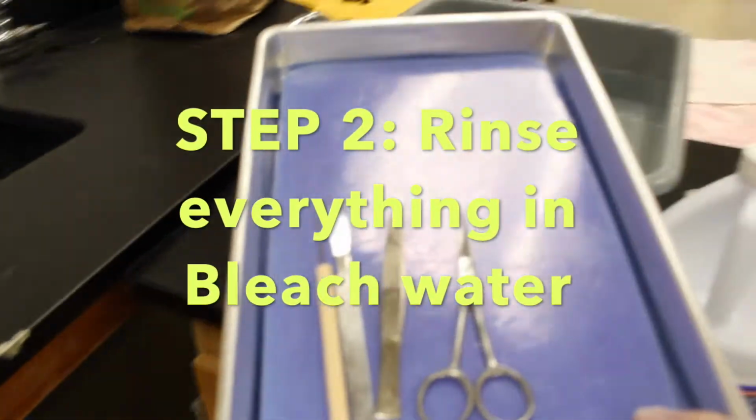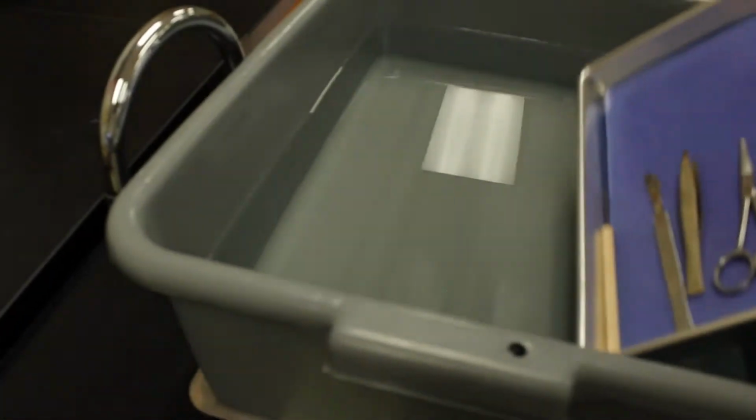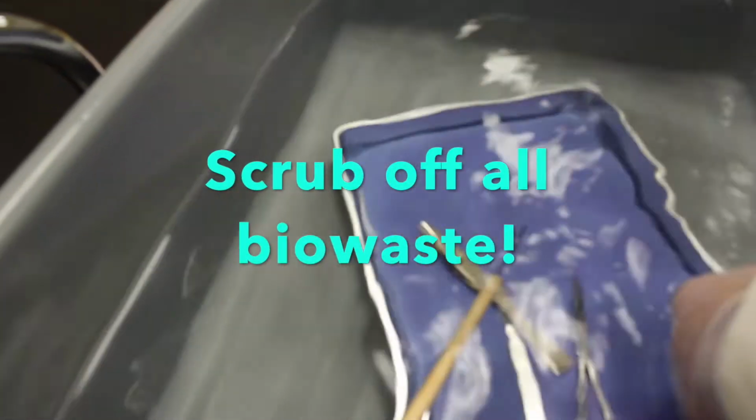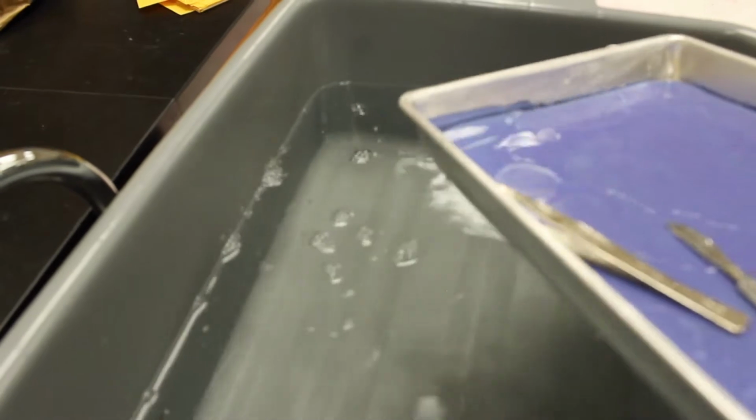Then you're going to take your dirty tray. You're going to rinse it in the bleach water. So, bleach water, that's where we rinse it. You're not going to leave it in here. So the first step is get off any parts in this bleach water, and that's going to disinfect it for us. Then you're going to take all your tools. So we need to rinse off that bleach.